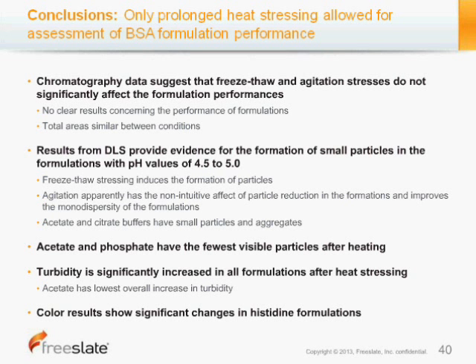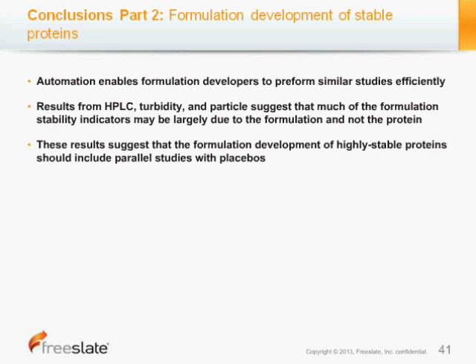And so overall, as far as looking at the formulation development of stable proteins, which a lot of biopharmaceuticals are, we can see that the automation enables formulation developers to do very similar studies like this. And as you can see, there is certainly some efficiency gained from these types of studies. We can see that the HPLC, the turbidity, and the particle counts suggest that many of the stability factors and stability indicators were probably due to the formulations themselves and not the protein.